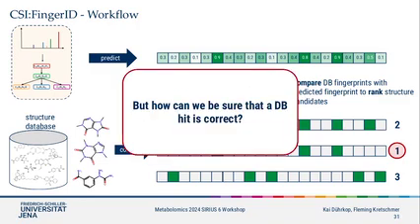The problem is, of course, if we really have a large data set with thousands of measured compounds, and we search in structured databases for each of these mass spectra, we will get a lot of wrong hits. How many compounds can be identified is really difficult to say, because it depends a lot on the data quality. Sometimes it's around 50%, sometimes it's just 30%. So a lot of your data will be just wrongly annotated. It's just as it is.